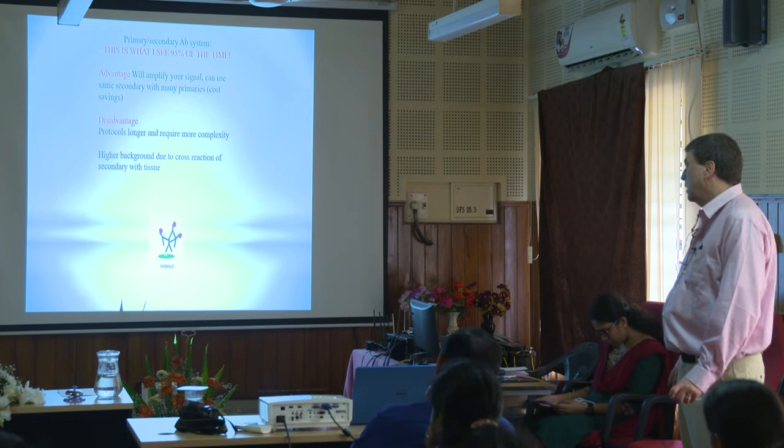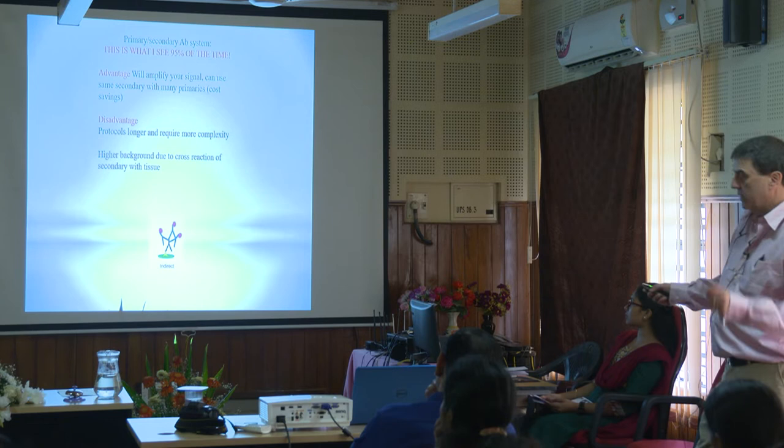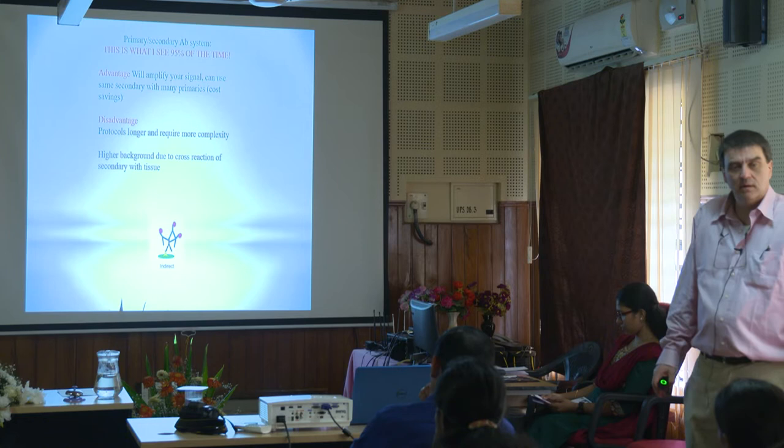Primary-secondary is what I see all the time. It amplifies your signal, and you can use the same secondary for many primaries. So if you're working with a whole bunch of different proteins and you have, say, five or six polyclonal rabbit antibodies in your lab, you could buy one secondary that would recognize all of those polyclonal rabbit antibodies.